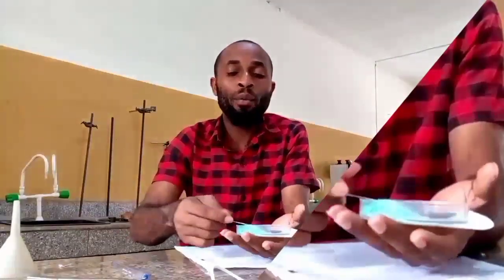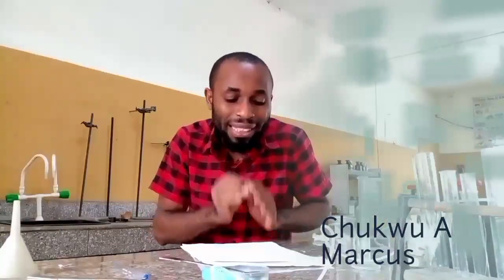But here there are possible command words we are going to receive from WAEC. Let me pick up my work here. I have some possible commands they are going to give you. The question can be in this form: C is a mixture of two inorganic salts. Perform the following exercises on C. Record your observation and identify any gases involved. State the conclusion you draw from the result of each test. That is the inferences. You need to make the inferences.